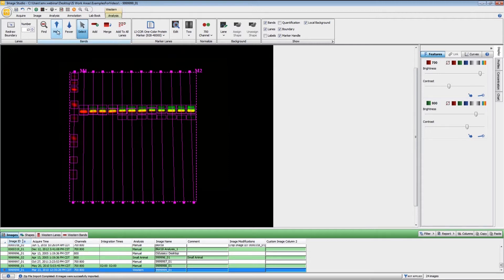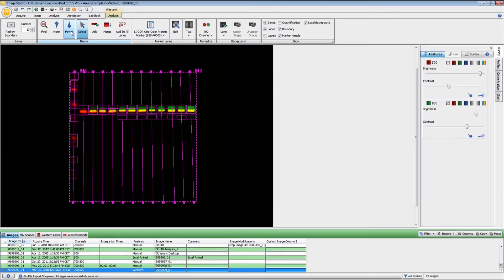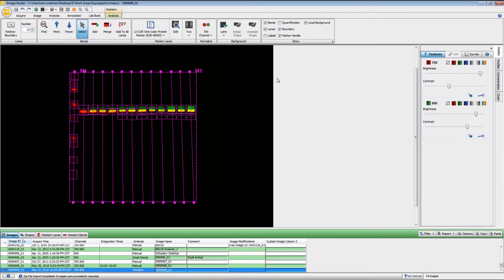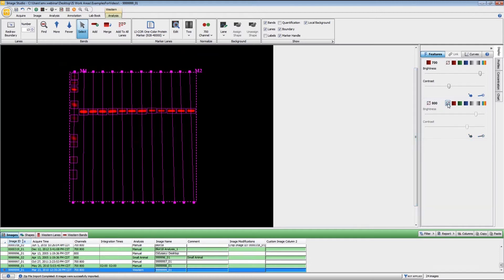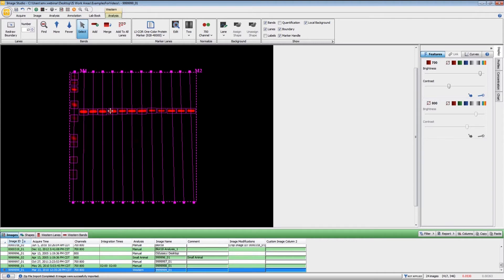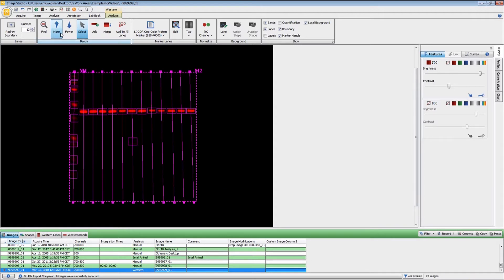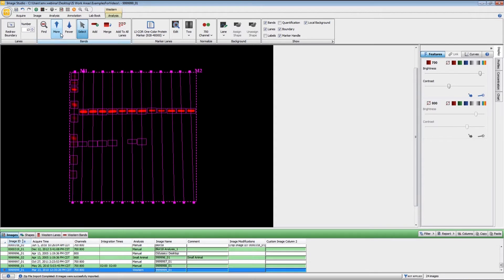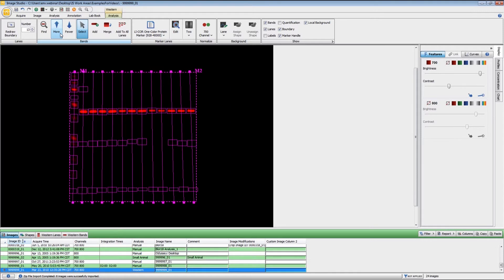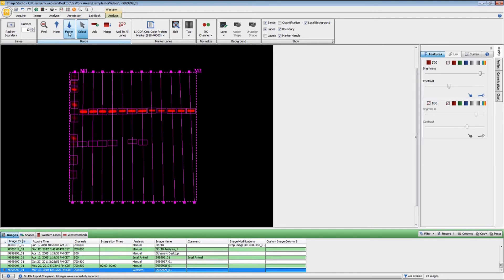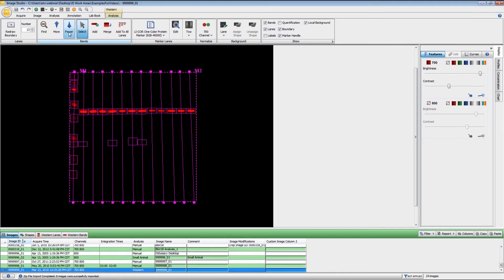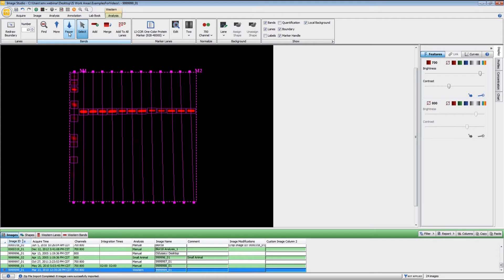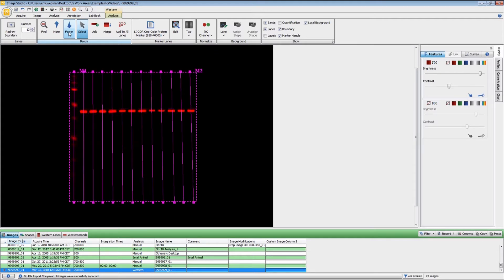You can adjust the band finding sensitivity using the more and fewer. If you're doing a two color blot, it's usually easier if you switch over to doing single color for finding the bands, because most of the time, you'll need different band finding sensitivity between the two different wavelengths. If I click on More here, you will see that we do get some more bands showing up. You can use the More and Fewer to find the correct number of bands.